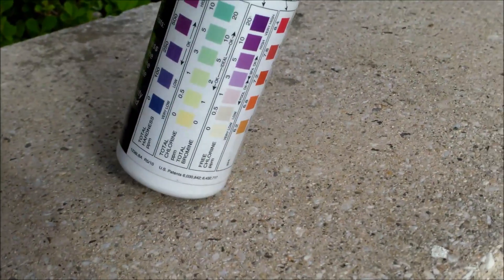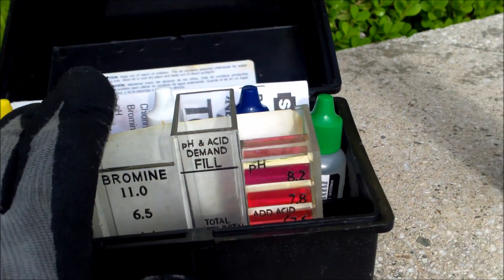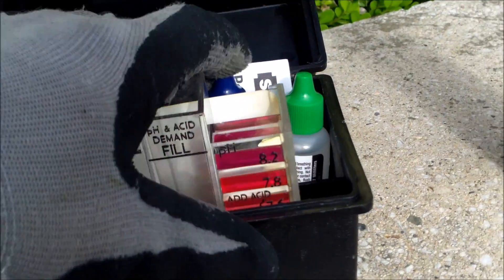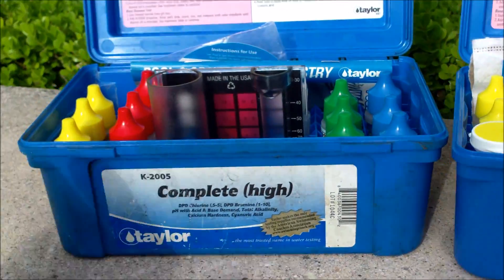The major disadvantage of the test strips is that they're not quite as accurate — they're more of a ballpark reading. The disadvantage of the 5-in-1 test kit is that it only does chlorine, pH, acid demand, and alkalinity. And the only disadvantage of the Taylor kits is that they're pretty expensive.